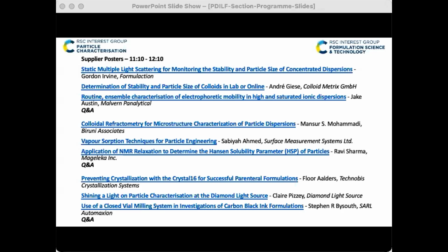Good. There's a couple more questions coming related to temperature control. That is the temperature control, and what's the maximum temperature you could go to, and the viscosity limit. Viscosity limit I just discussed. I don't know it. My principle is if it will flow, then it will mill. What was the other question?